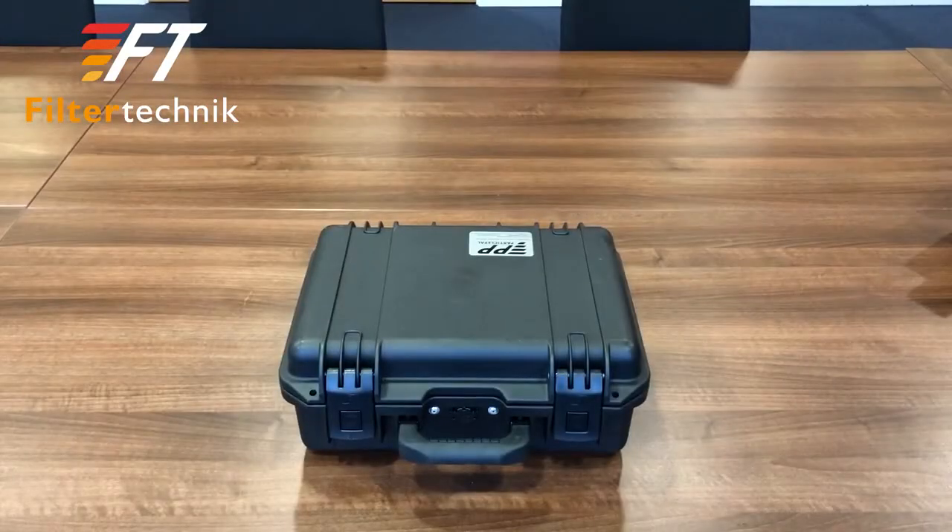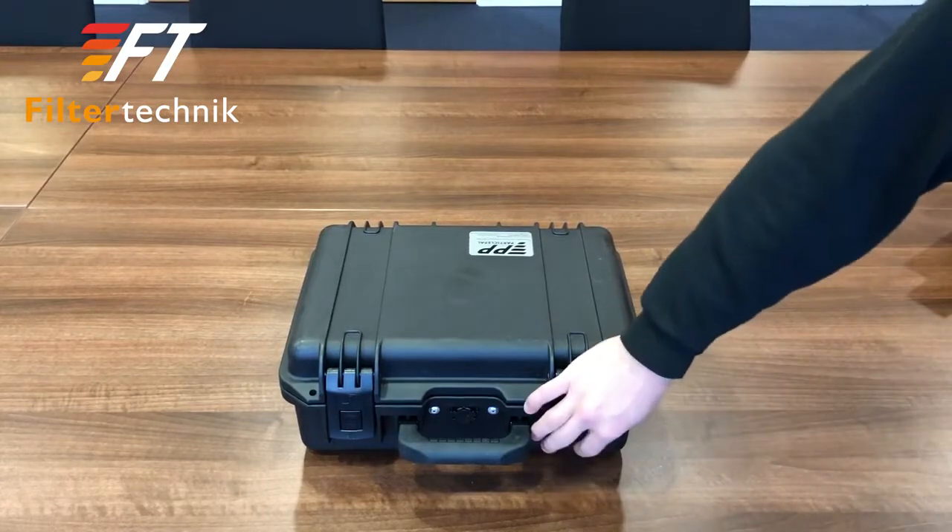Hello and welcome to the first how-to guide to using the ParticlePal Pro. Firstly we'll start with the basics and look at the unit as a whole and what's included.